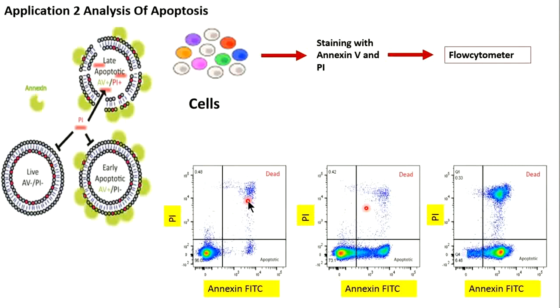Very interesting application. So we can find the proteins on the surface like CD3, CD4, CD19. So actually we are finding whether your cells are T cells, B cells, natural killer cells or not. Then we can find live and dead percentage of cells, as well as apoptosis negative, apoptosis positive percentage of cells. So some really interesting applications are going on.